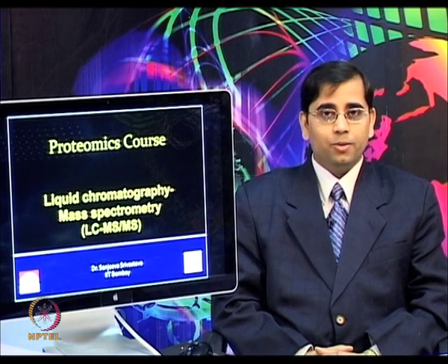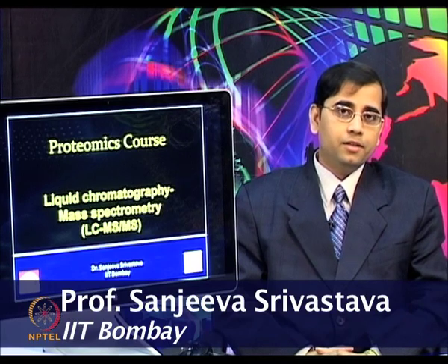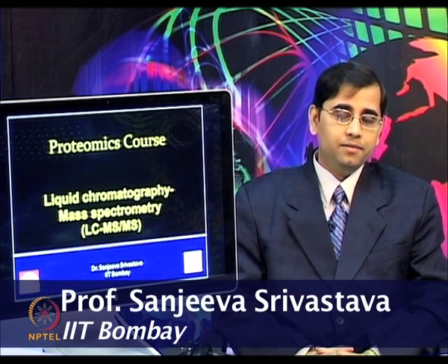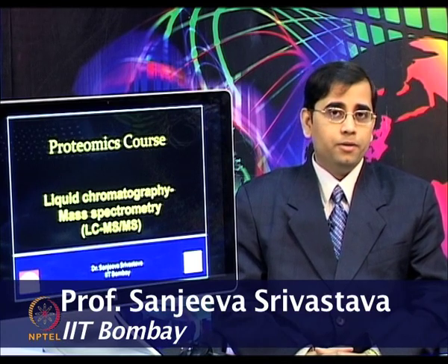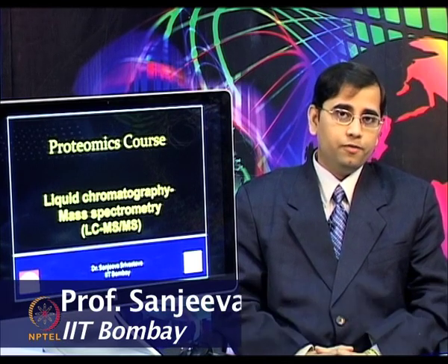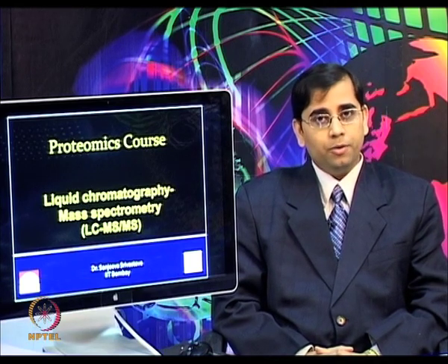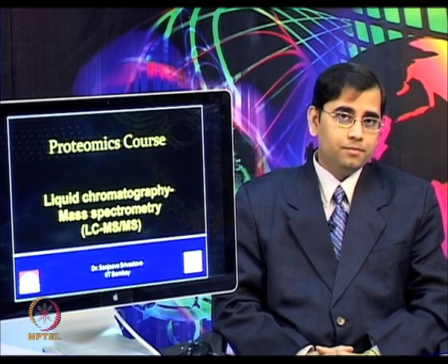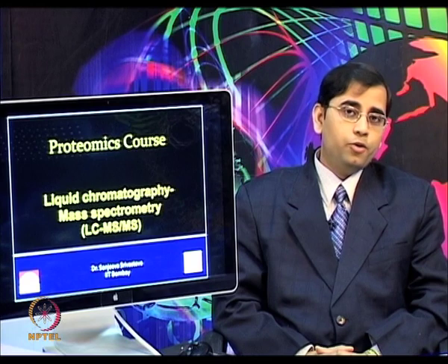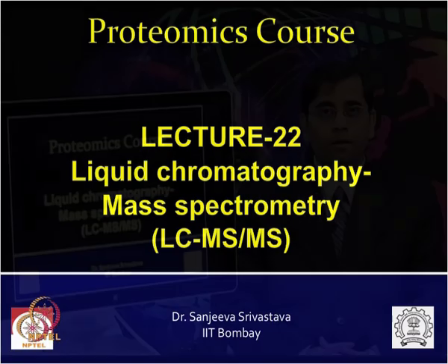Welcome to the proteomics course. In this module, we are discussing mass spectrometry techniques. In the previous lectures, we talked about basic concepts of mass spectrometry. Then we discussed multidimensional MS, and now today we will talk about liquid chromatography mass spectrometry or LC-MS.